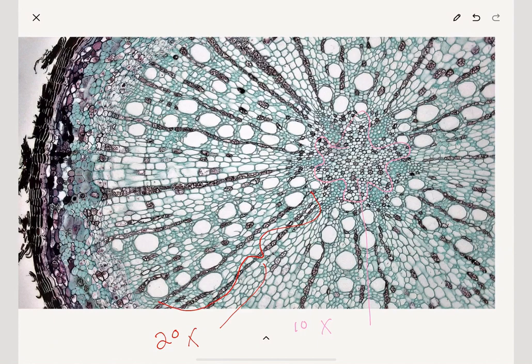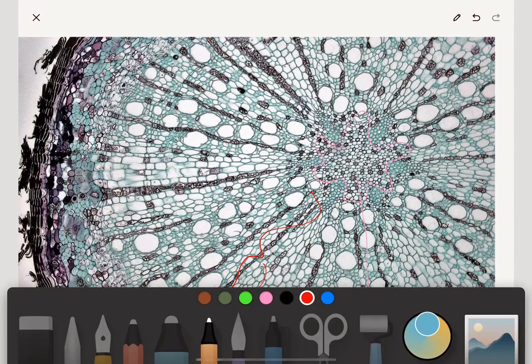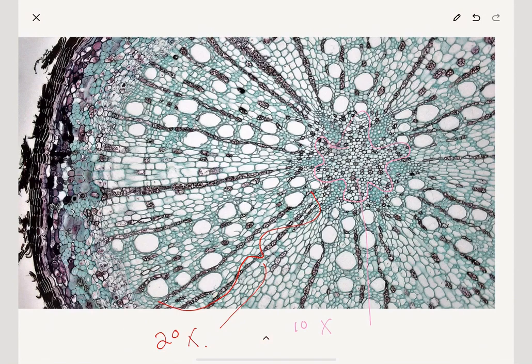The vascular cambium is visible as a very, very thin, sort of pancake thin layer of cells to the outside of that secondary xylem. You know it's the vascular cambium because it's the thinnest cells. The cells to the outside will be expanding because they're becoming phloem, and the cells to the inside will be expanding because they're becoming xylem. I'm labeling it here in this thin black pen. That is the vascular cambium. And that means that everything to the outside of the vascular cambium will be bark.